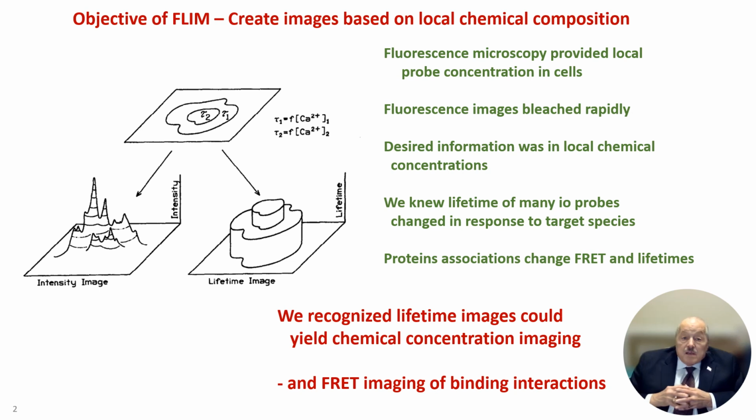So what's the objective of FLIM? We want to get an image of the sample that is based on the chemical composition and not on the amount of probe that's in any one place.